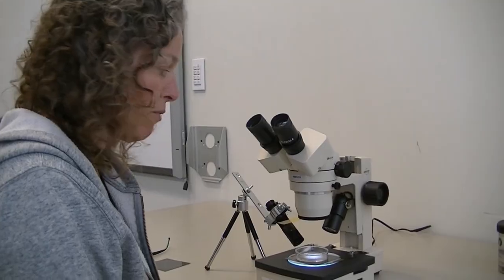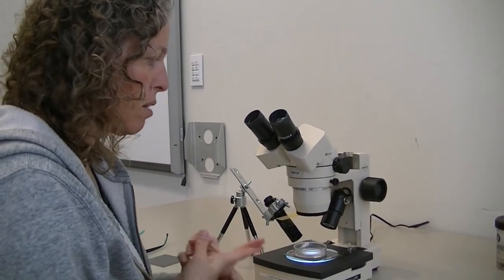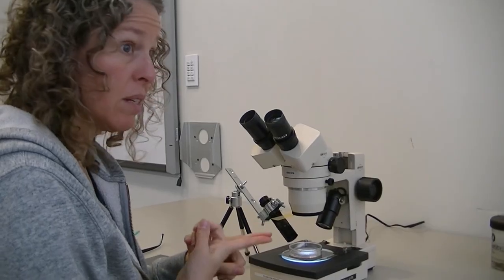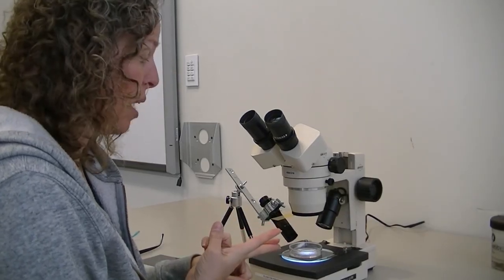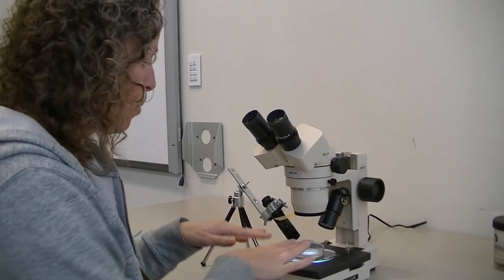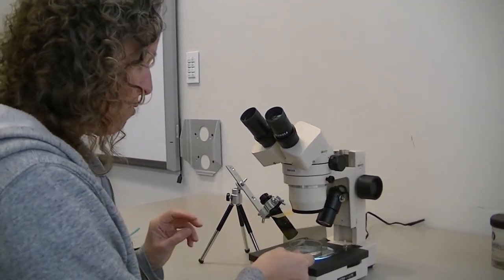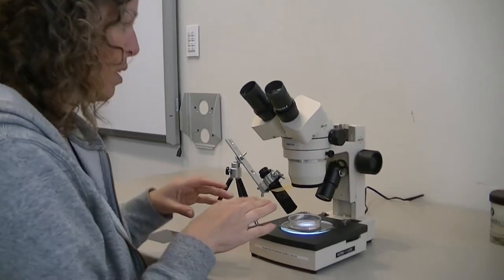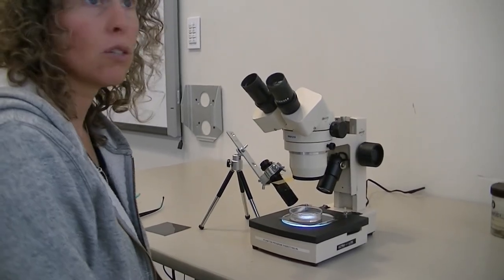Just to confirm, we've seen the cigarette fiber red and fluorescing, and we've seen it highly polarized. Now I'm checking under just bright field with no polarization film on, checking to see if there's cellular structure.